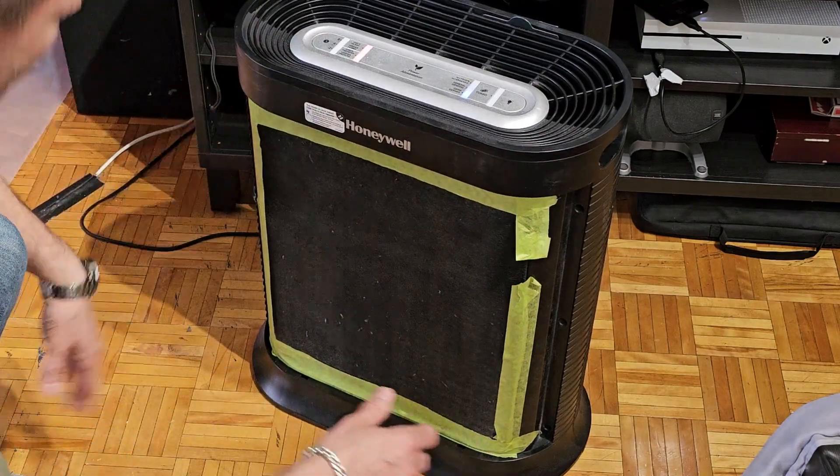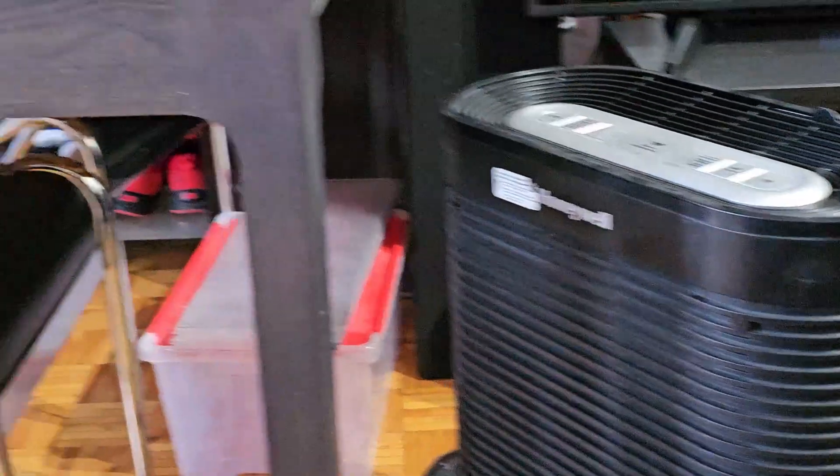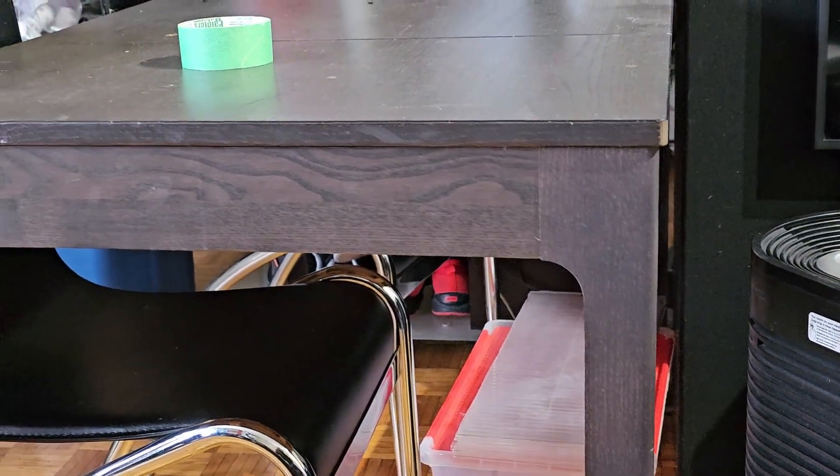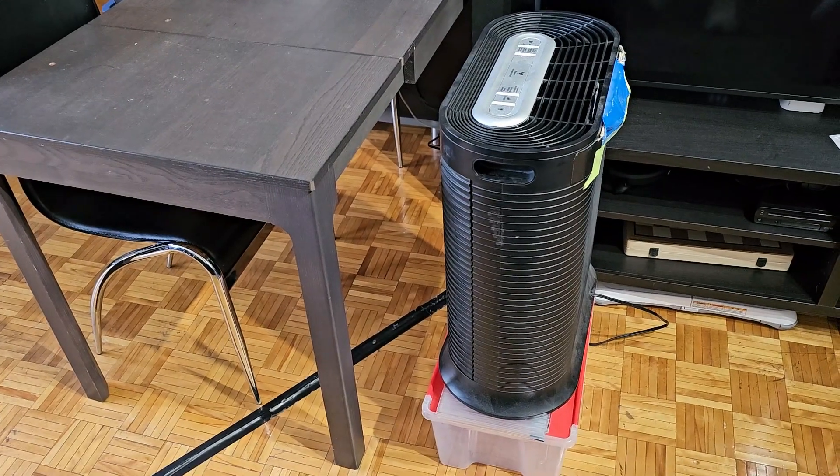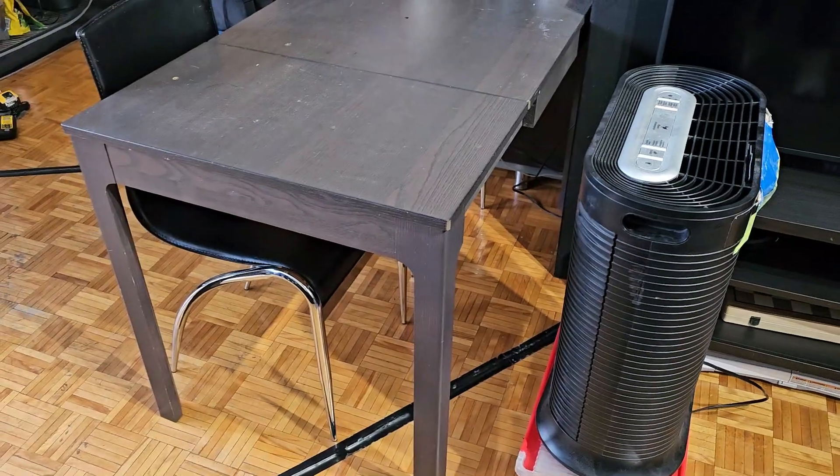You want the top of this to be level with whatever surface you're going to use. I've got it propped up on my bucket and we're level with the table.